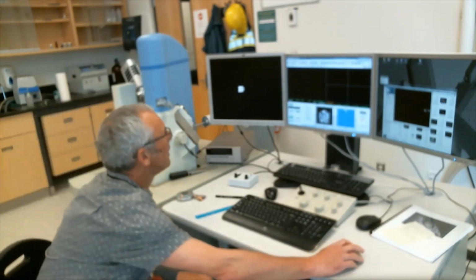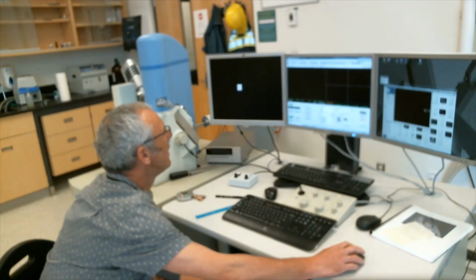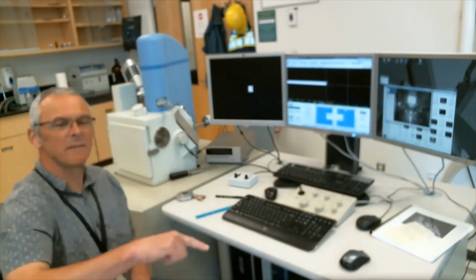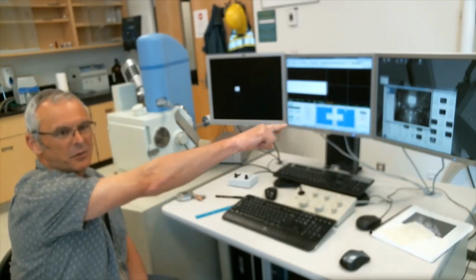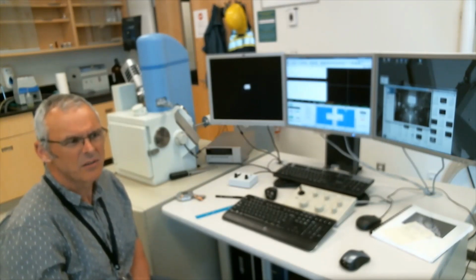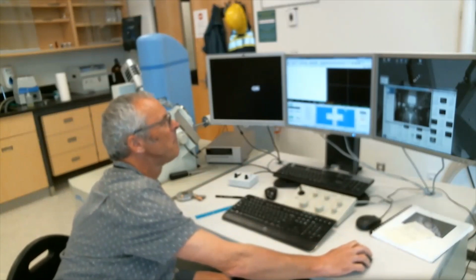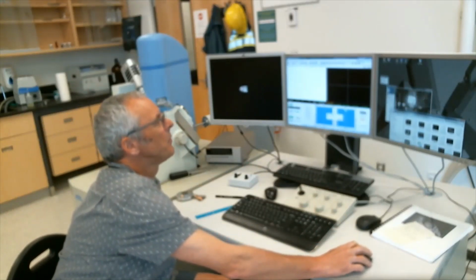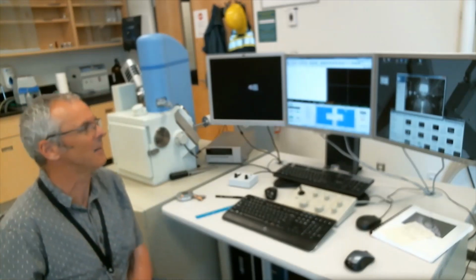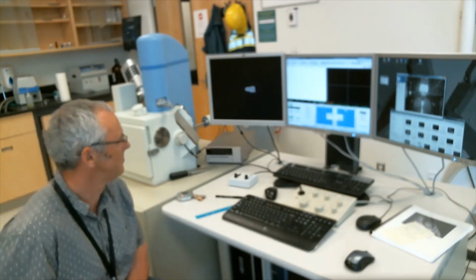Okay. So I want to go look at, I've already looked at this morning, so I know exactly where I want to go. We've also got an infrared camera on this screen over here that shows us a side view of the sample coming up, and it's an infrared light, so we can see the sample coming up and make sure that we don't actually touch anything in there.